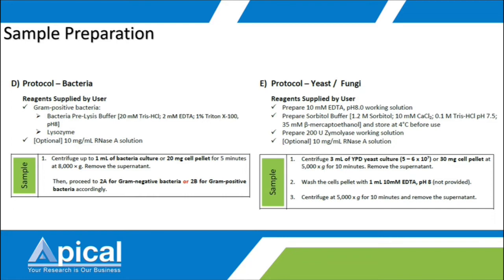And maybe also for water samples from the ocean, because now our ocean is contaminated with heavy metal also, right? So for all these samples, it is important to pre-wash with EDTA, then centrifuge and remove the supernatant, and then the cells are ready for lysis.